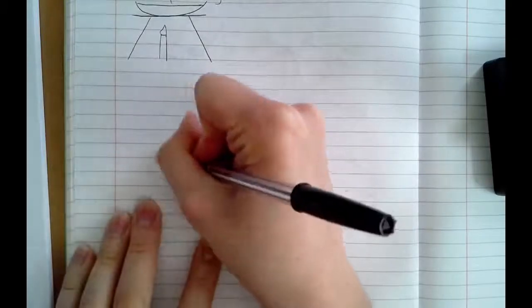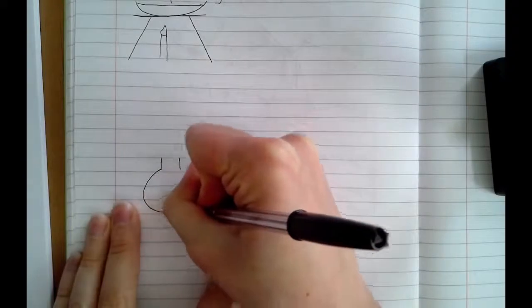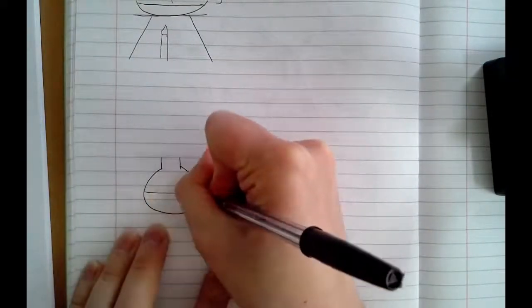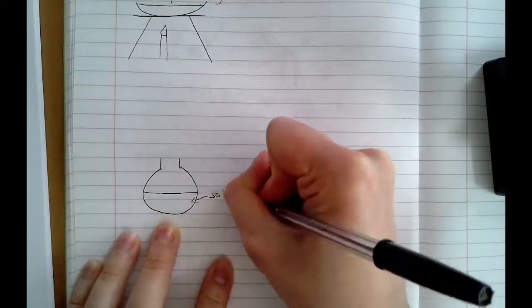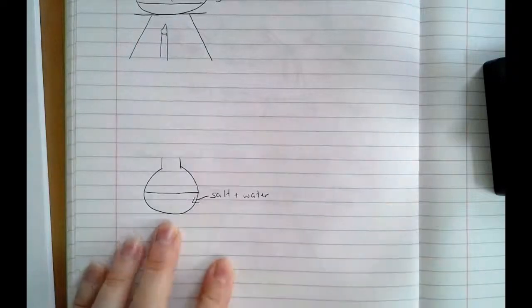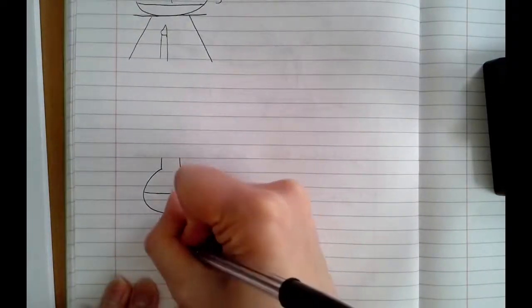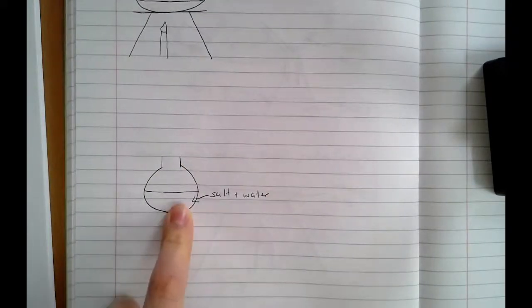You're going to start off though with what we call a round-bottomed flask instead of an evaporating dish. And into my round-bottomed flask, I'm going to put salt and water. I do still need to separate the salt from the water, and I am still going to be using the process of evaporation. So I'm going to be heating my round-bottomed flask.